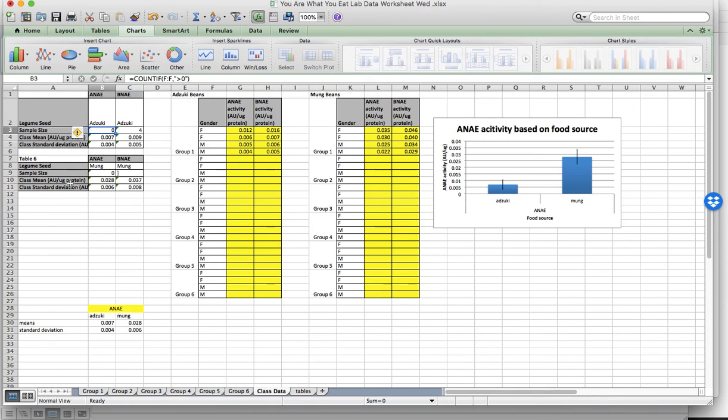So if both you, the reader, who does not know what the discussion portion of the paper is, look at the results and come up with the same conclusions, that's, I think, a solid paper. So you should aim for just showing unbiased results in your results section. So for that, to get full credit, you need to include the standard curve and equations for the protein assay. Don't include the raw data, but just show the graph and the equation, and you can also include the R-squared value.